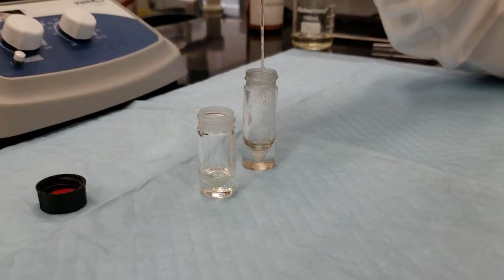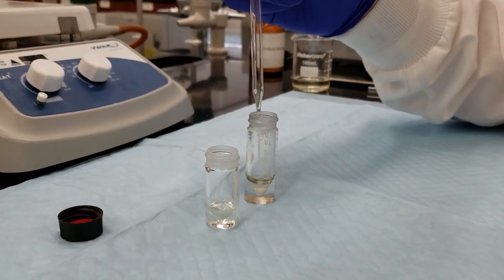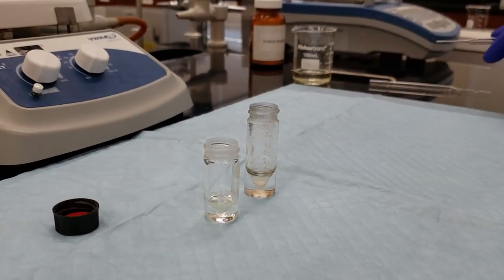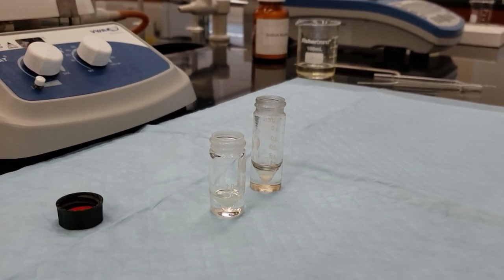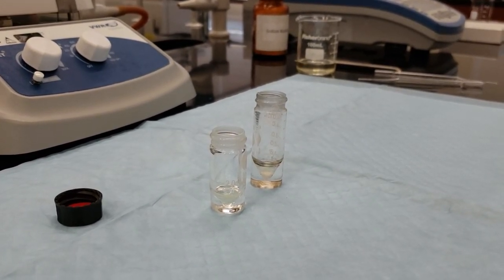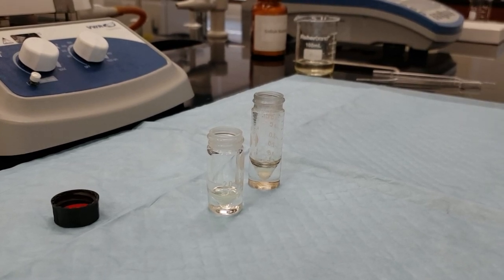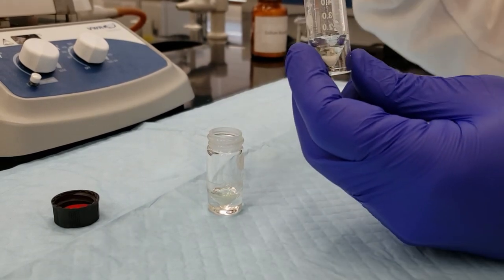Let's see, I drew up a little bit of particulate with that. I don't know if you can see that on the camera. Yeah, so I want to make sure that I push that back out, and I'll actually change over to another pipette just to be safe. I'm going to actually pick it up.